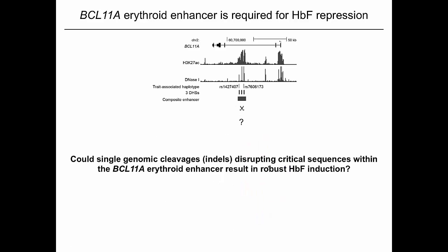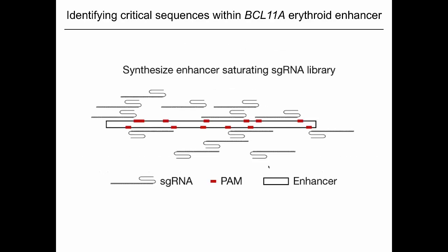But the question we wanted to ask was, would single genomic cleavages, indels, just disrupting minimal critical sequences within this enhancer result in robust fetal hemoglobin induction? And so to ask this question, we took the approach of conducting an agnostic screen. And so I want to go through the design and the performance of this screen.